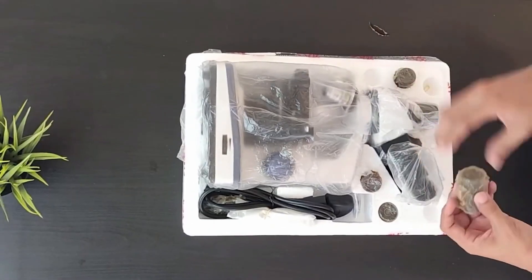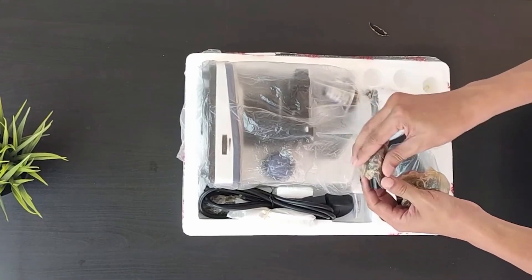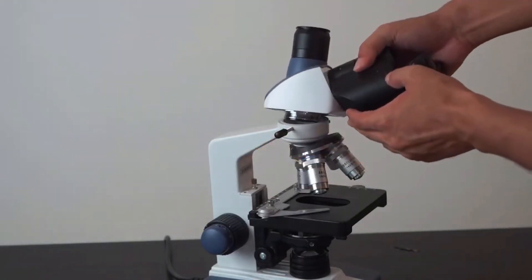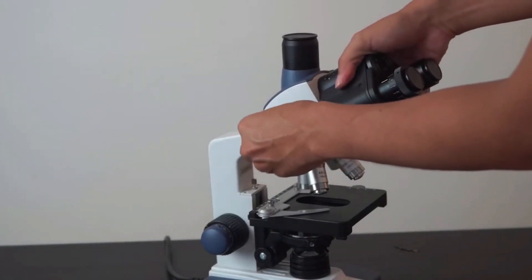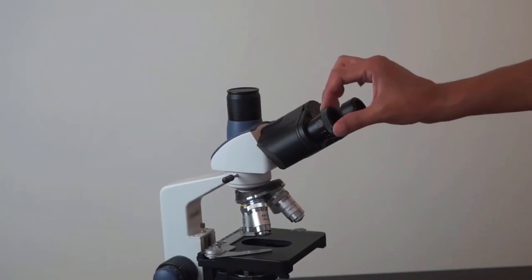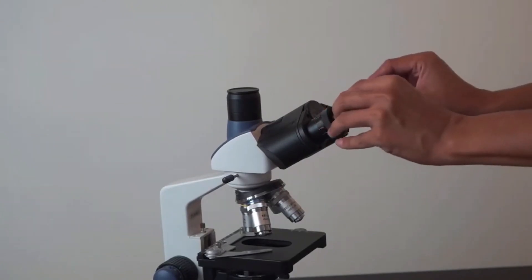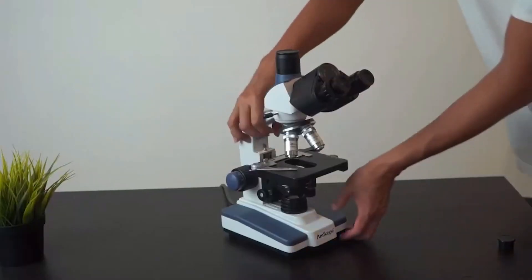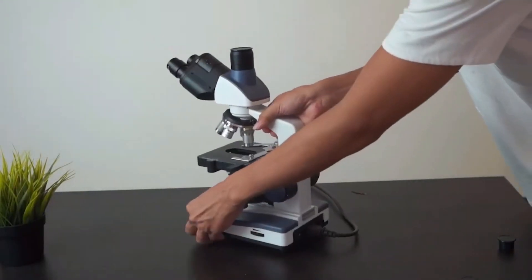You'll also appreciate the double layer mechanical stage, featuring 1mm stage divisions. This handy feature locks your slides into place and offers precise manipulation along both the X and Y axes. This means you can record specific coordinates on the slide, making it easy to return to a particular location for further observation.